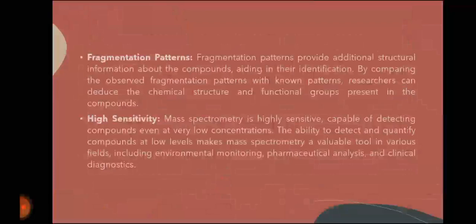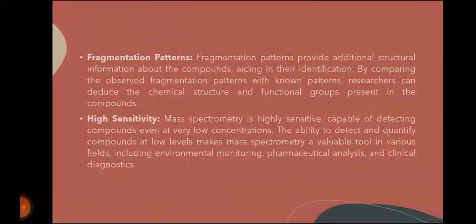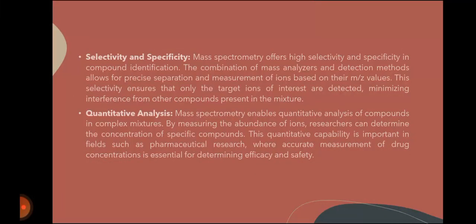The ability to detect and quantify compounds at low levels makes mass spectrometry a valuable tool in various fields, including environmental monitoring, pharmaceutical analysis, and clinical diagnostics. Third, selectivity and specificity. Mass spectrometry offers high selectivity and specificity in compound identification.